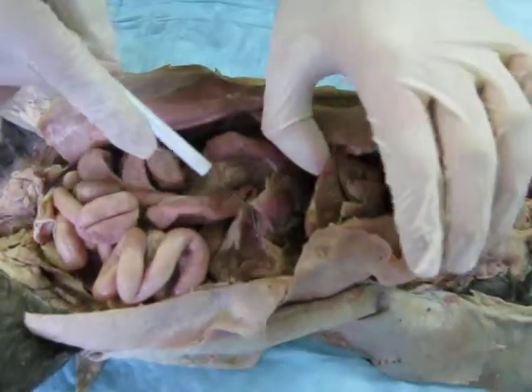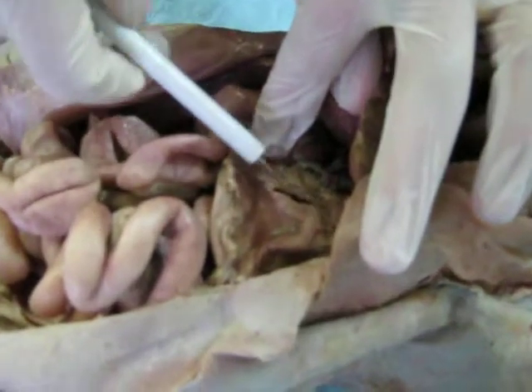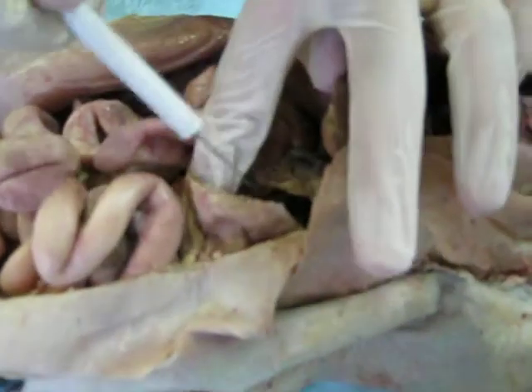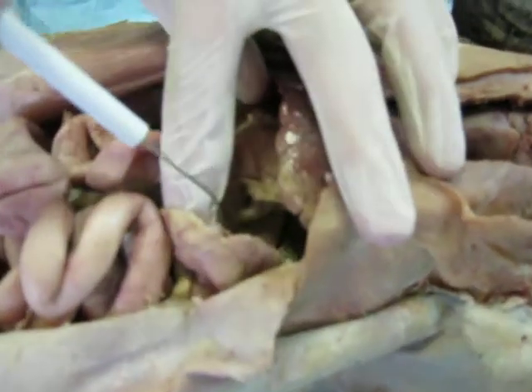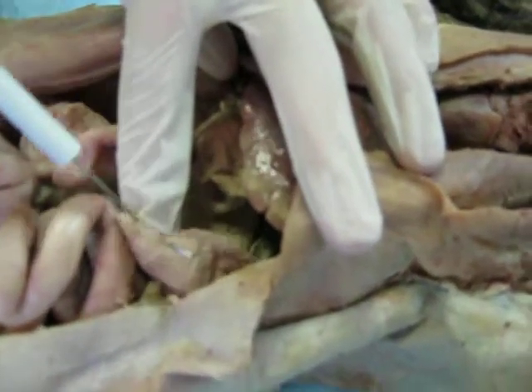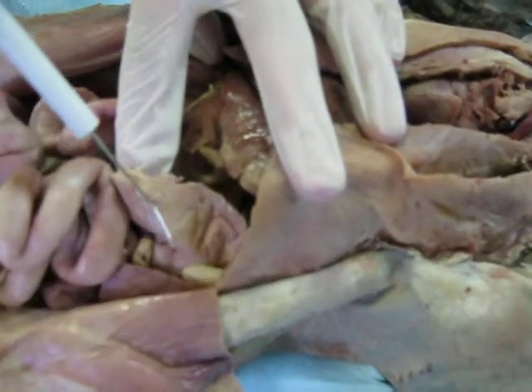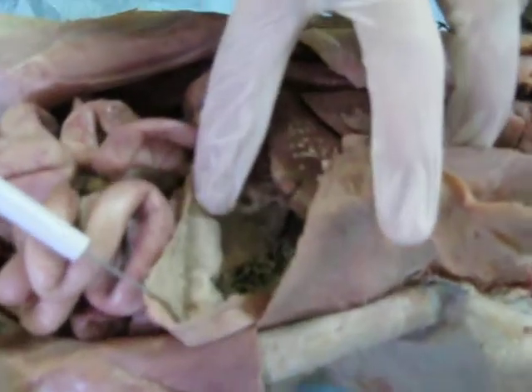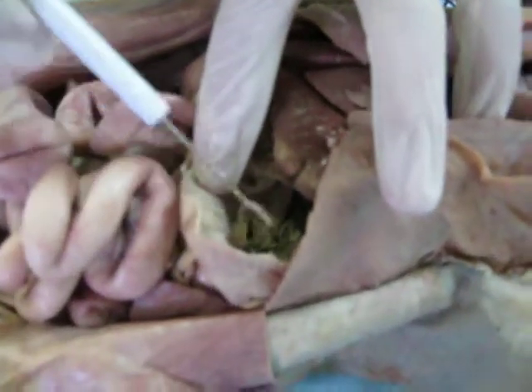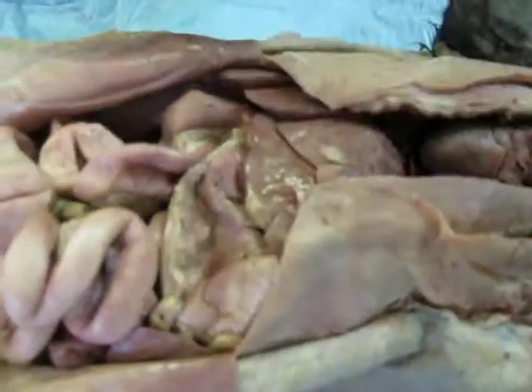The stomach breaks down food both mechanically and chemically using stomach acids. On the inside we see the lining of the stomach, and we can see the gastric rugae within the stomach, and the function of the gastric rugae is to break down materials. You can see in ours we have worms. Our cat had worms and a variety of other different foods in there.